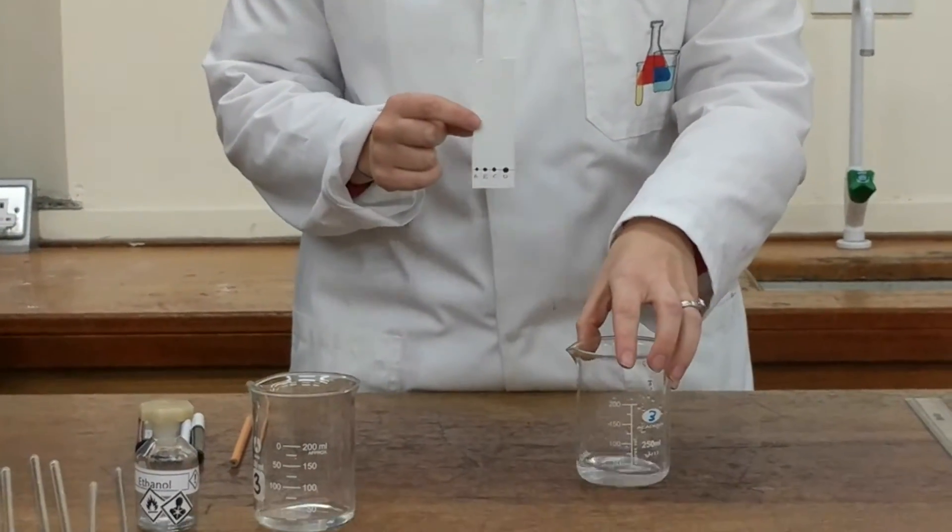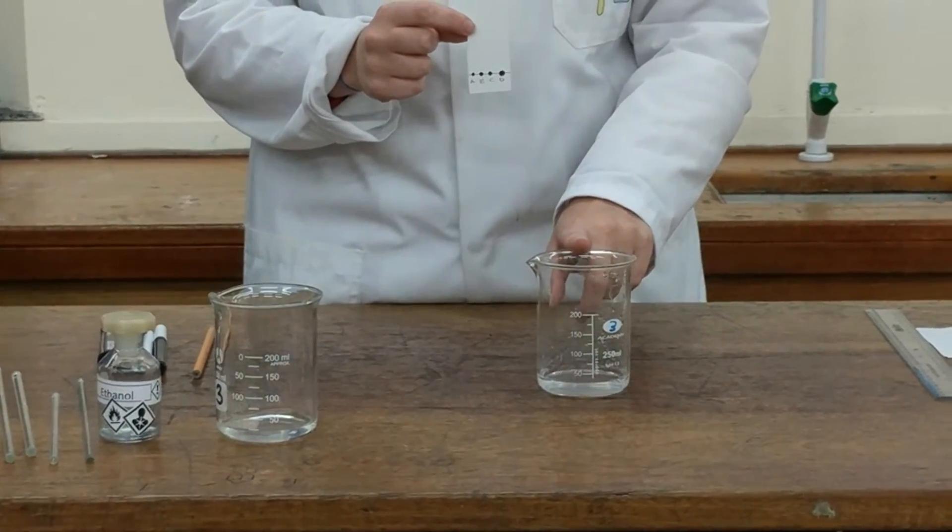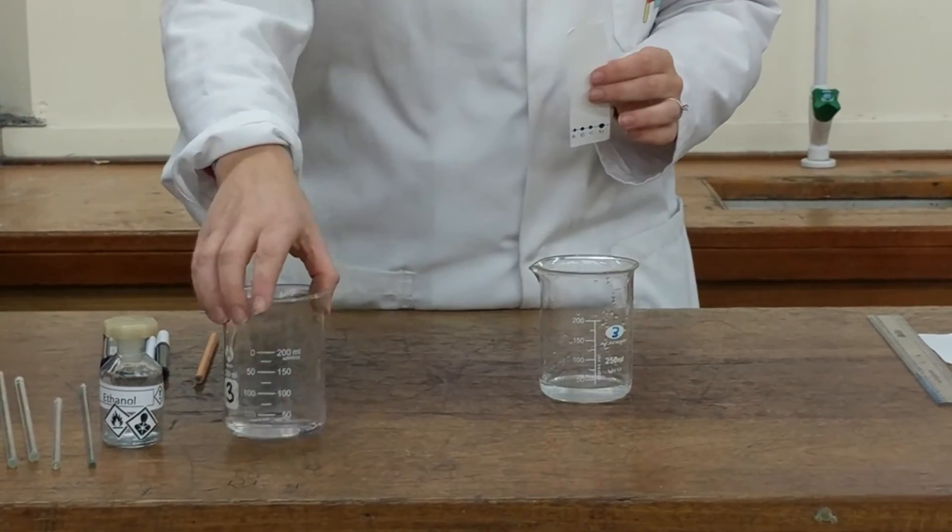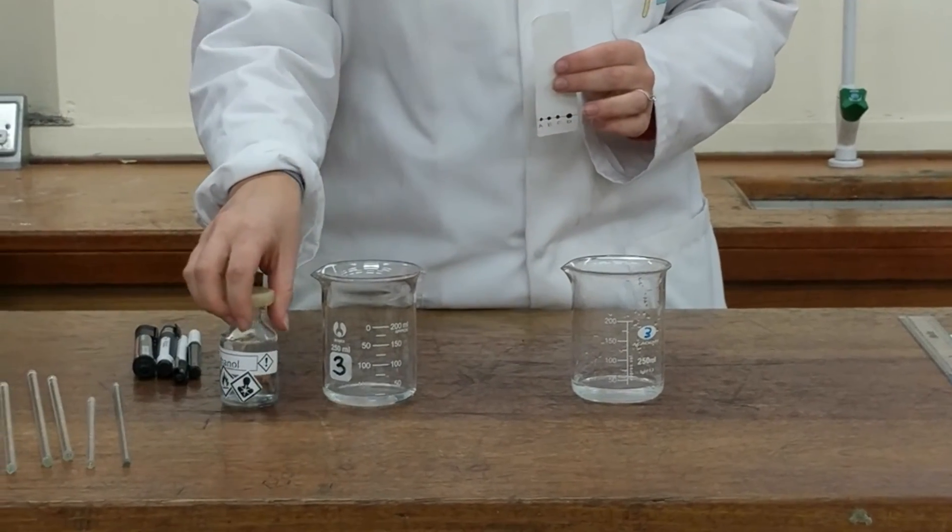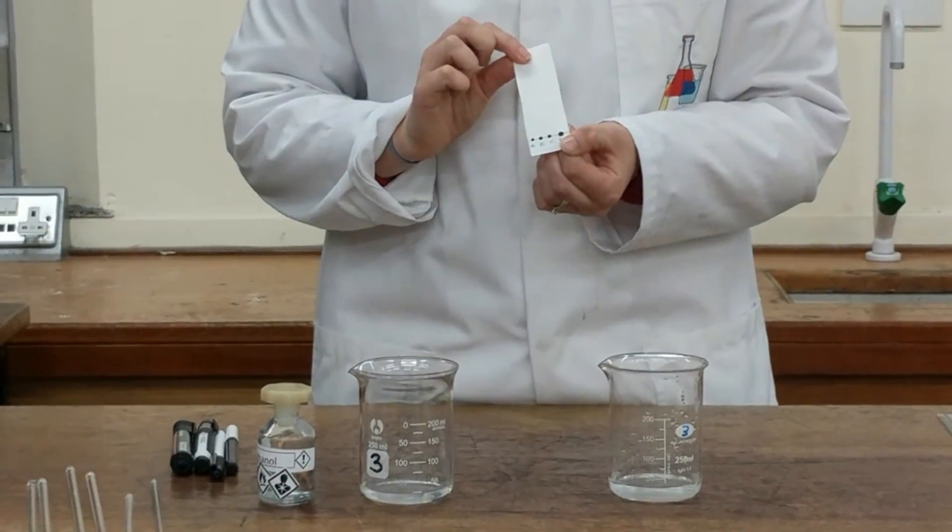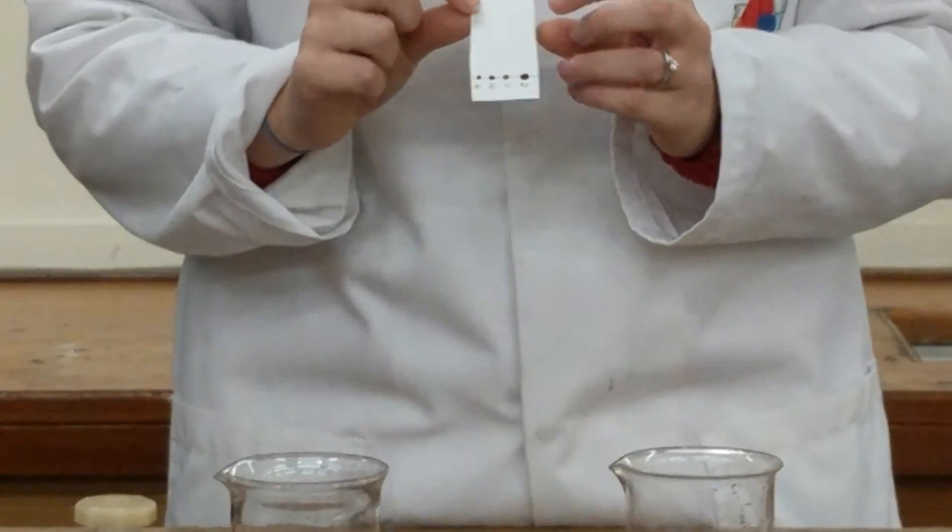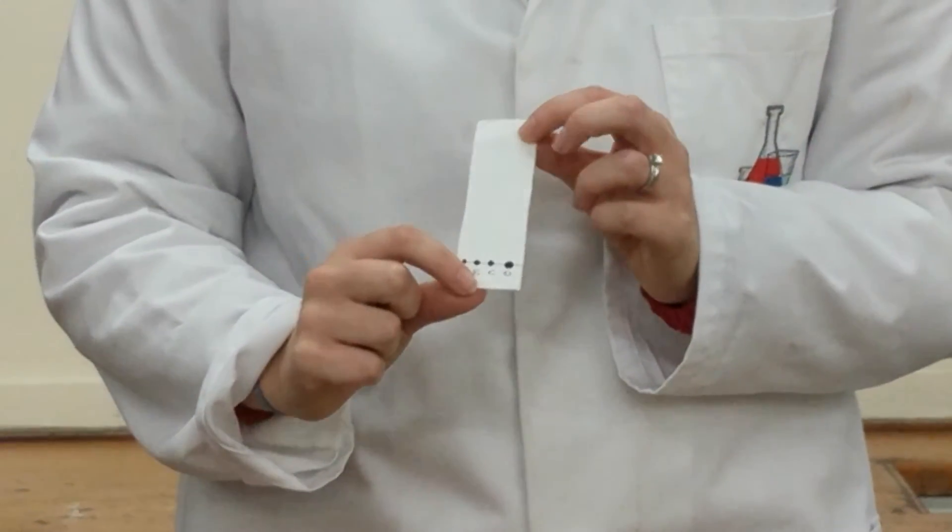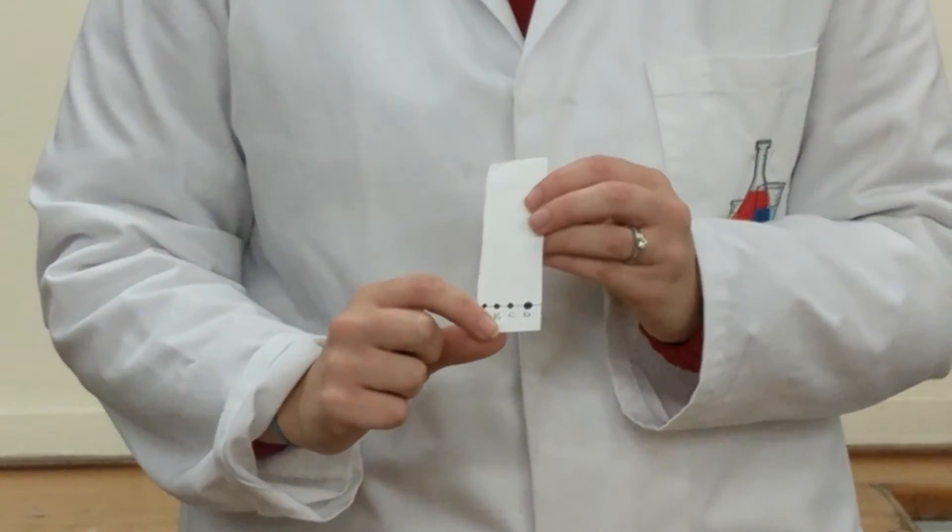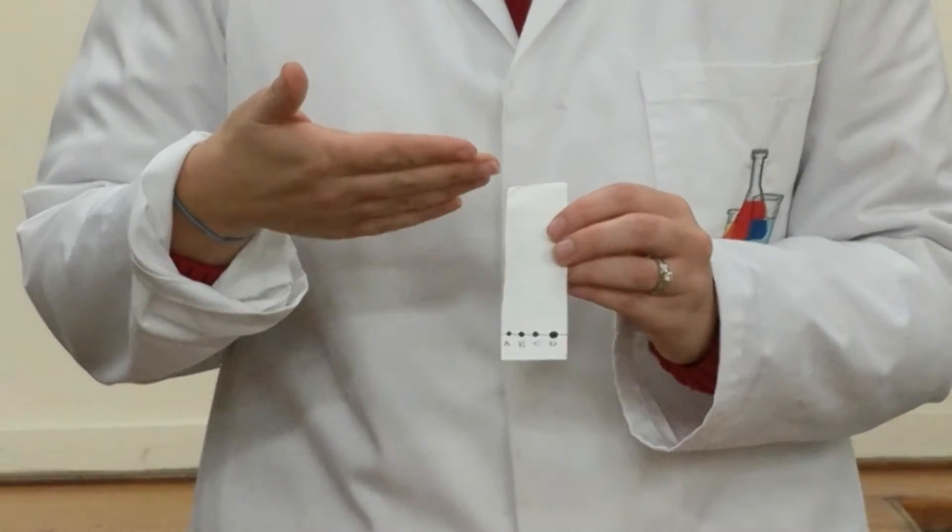So in this beaker here we've got water, which is going to be our solvent, and in this beaker here we've got ethanol, which is a different solvent that you can use. The stationary phase, stationary because it's not moving in the normal sense of the word stationary, is the paper. The mobile phase is the solvent that's actually going to be moving, mobile moving up the paper.